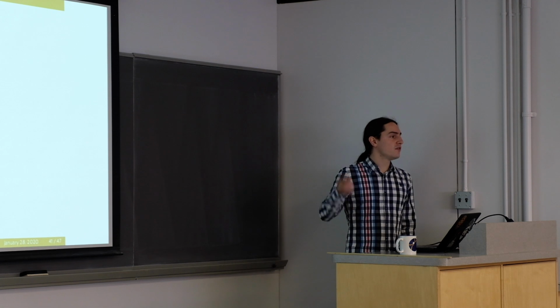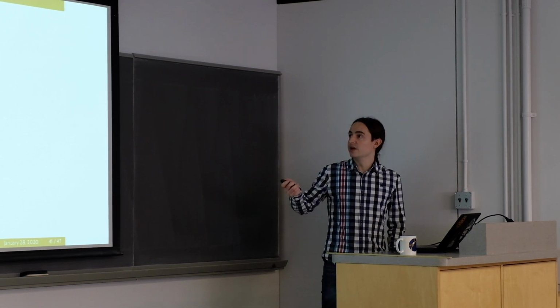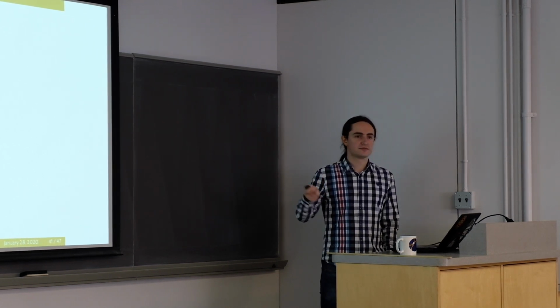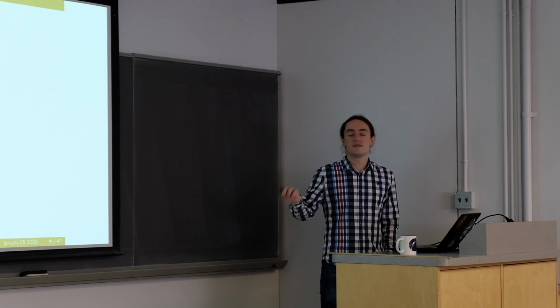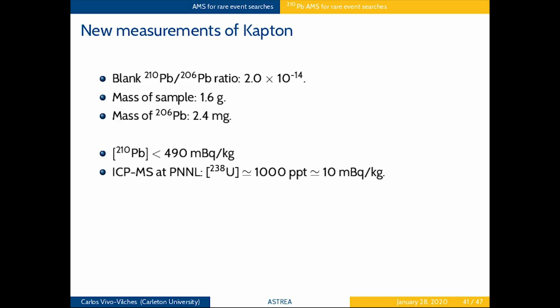These measurements are pretty new, from the last week, from these new Kapton samples, where we already have a closer blank sample than we had in the previous measurements. And taking into account that we are using a much higher amount of sample, we reduce this upper limit of the lead-210 concentration by two orders of magnitude.